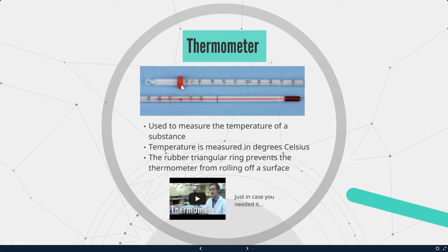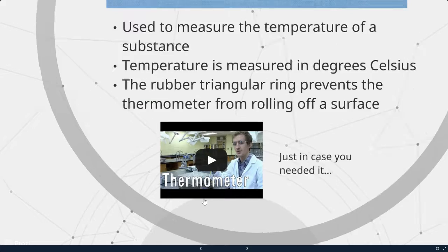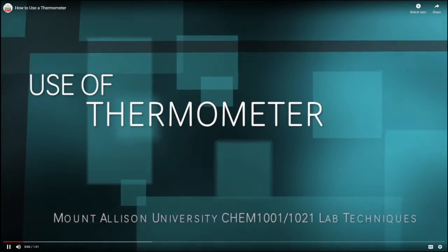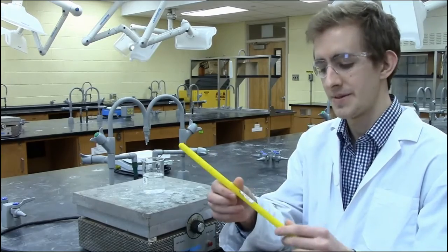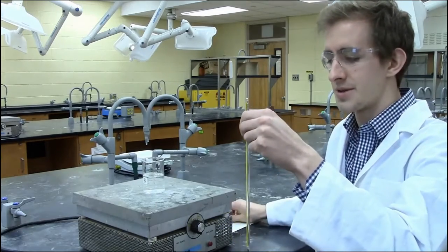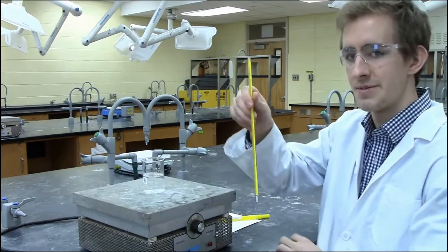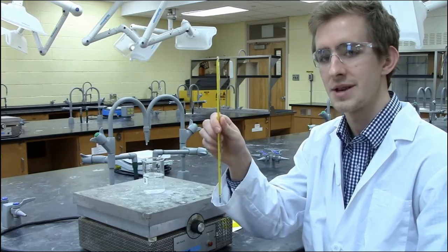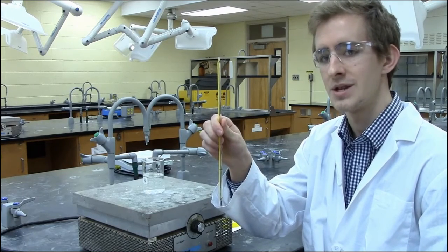The rubber triangle ring prevents the thermometer from rolling off a surface, making it stationary. Our thermometers at school look a little different from this, but pretty much the same. The thermometer often comes in a yellow protective case. When handling it, make sure you try not to hold it by the bulb, as that will influence the temperature you are reading. The thermometer is precise to 0.2 degrees Celsius and has a range of negative 20 to 110 degrees Celsius.